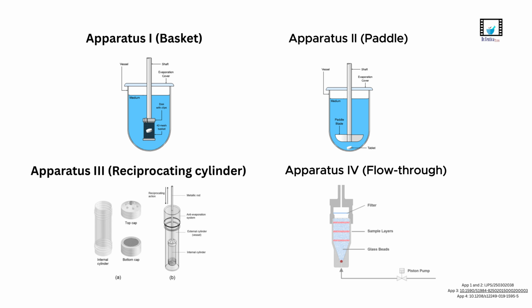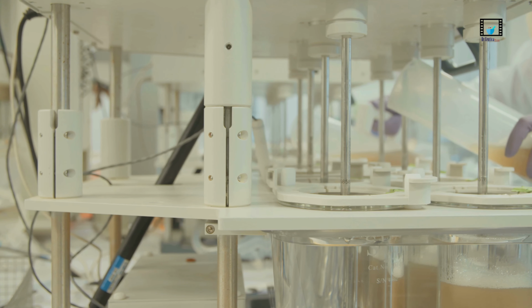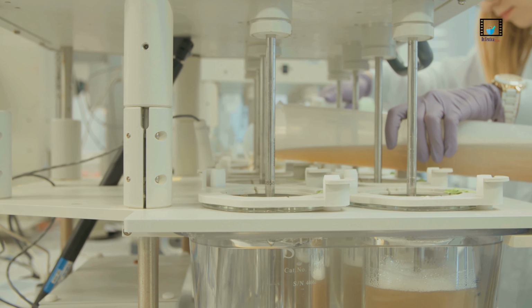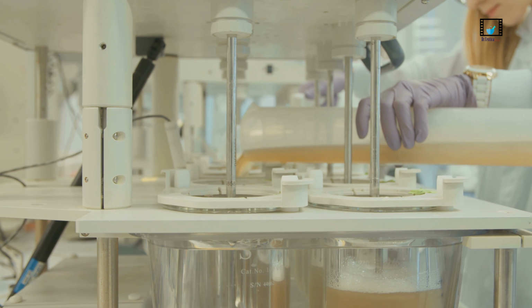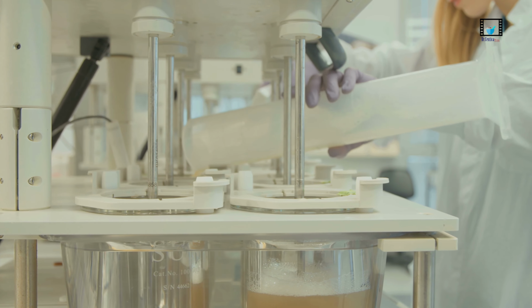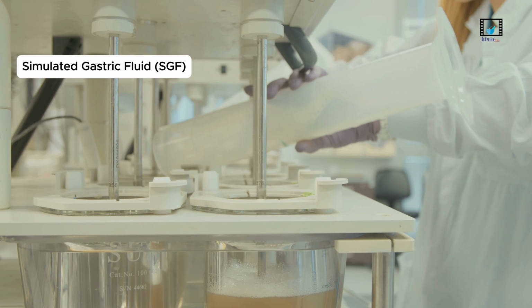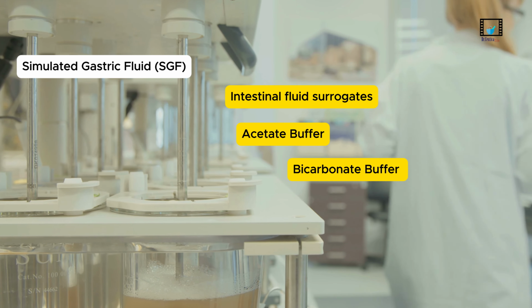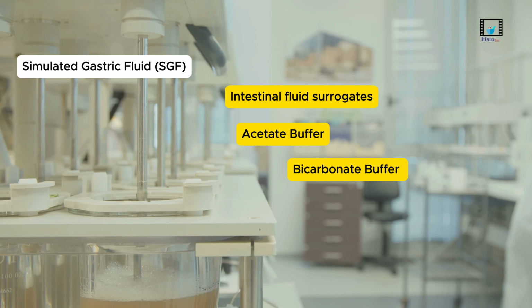delivery systems. The dissolution medium itself is carefully selected to simulate physiological conditions within the gastrointestinal tract. Commonly used media include simulated gastric fluid, acetate buffer, and more recently a bicarbonate buffer, and also phosphate buffer.